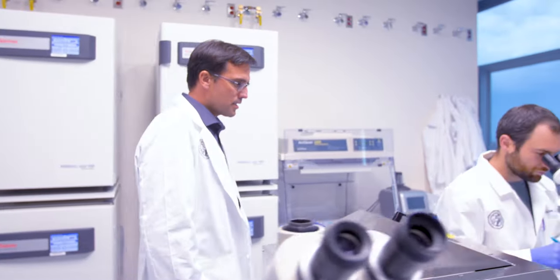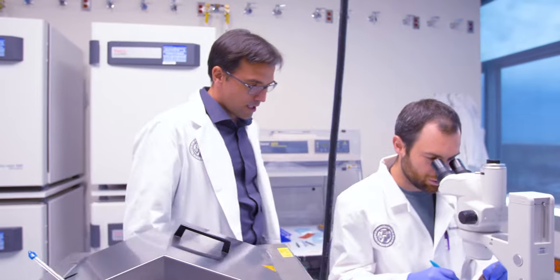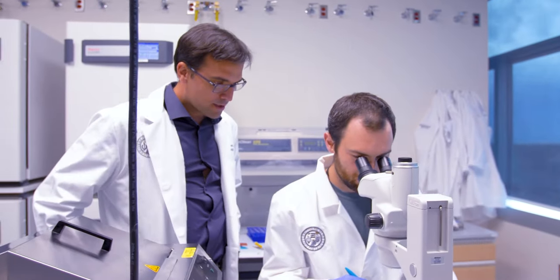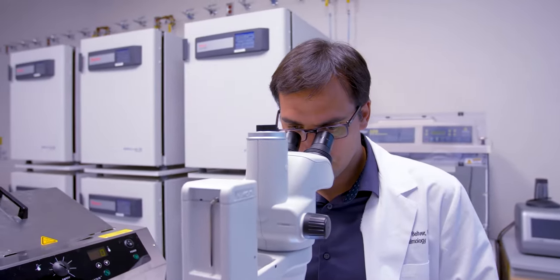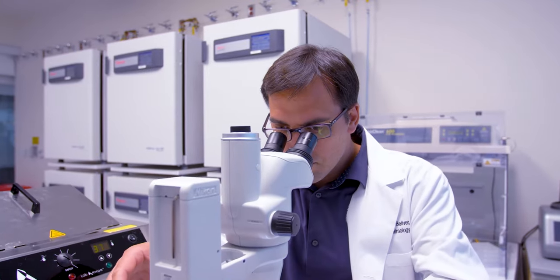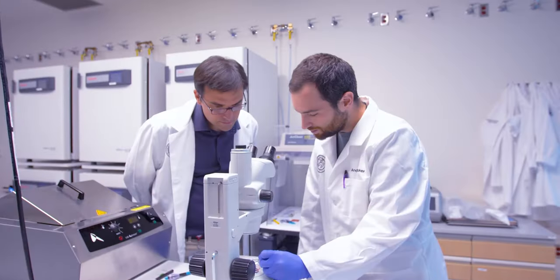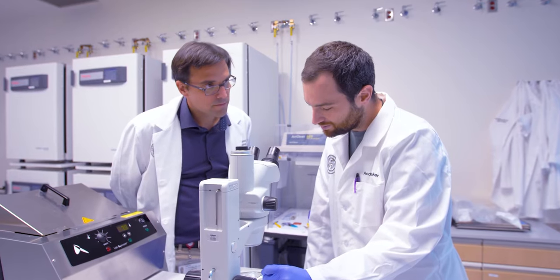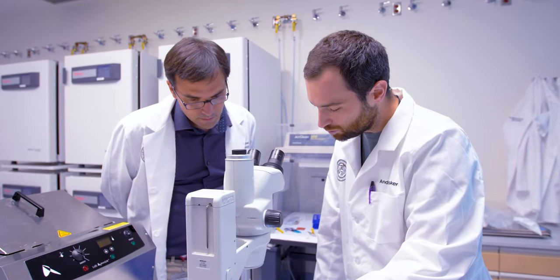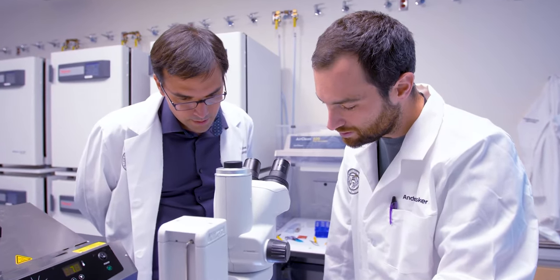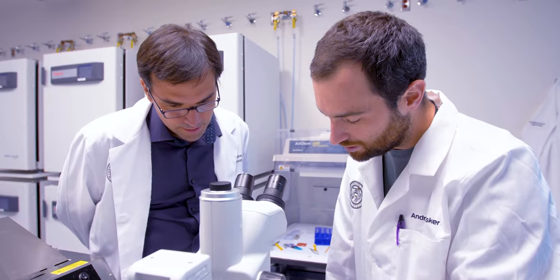Our retinal tissue complex recreates the cellular organization of the outer retina, including a layer of RPE cells, an outer nuclear layer that contains all photoreceptor subtypes, an outer plexiform layer, and the associated bipolar and horizontal interneurons, as well as Mueller glial cells.